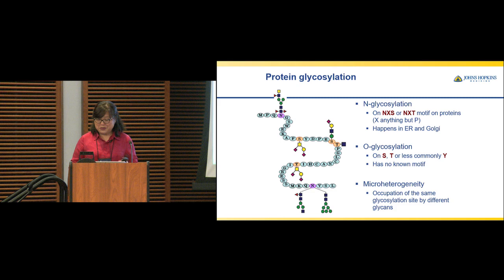So these are the two types of glycosylation I'm going to focus on today. For example, in the cell surface or extracellular or secreted proteins, proteins are often modified by N- and O-linked glycosylation, even though they are also modified by other modifications like GPI linkers or polysaccharides. Those are two modifications that are very commonly observed, especially with the advancement of technology recently, and we see more of the common modifications in most proteins.